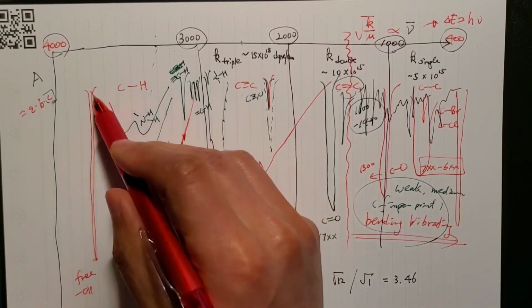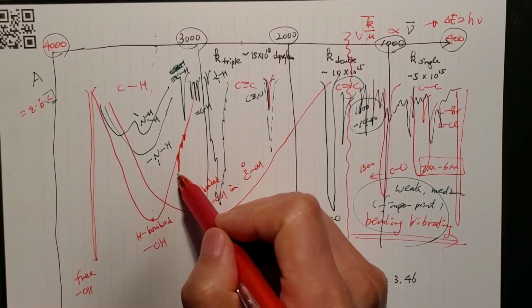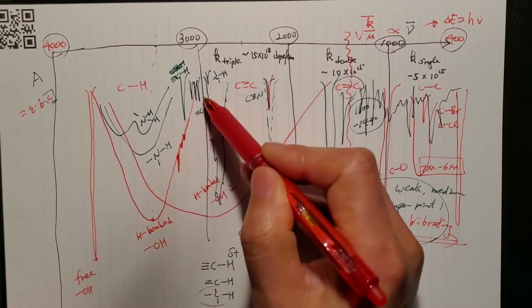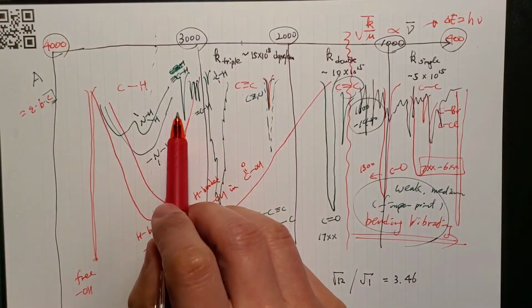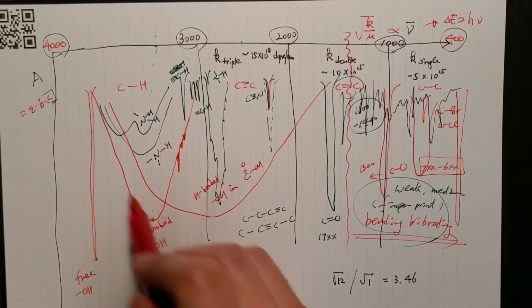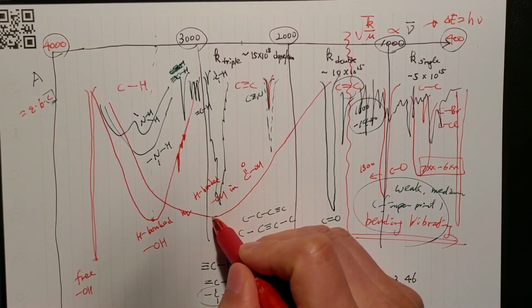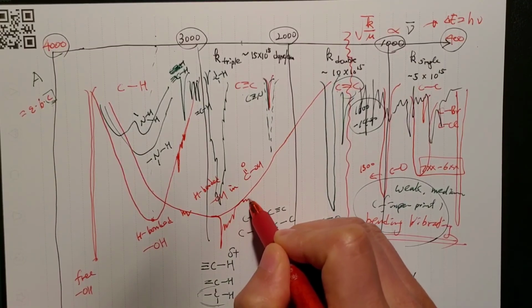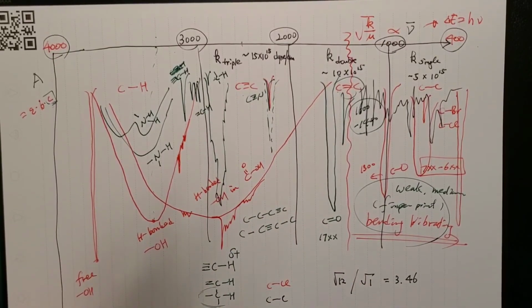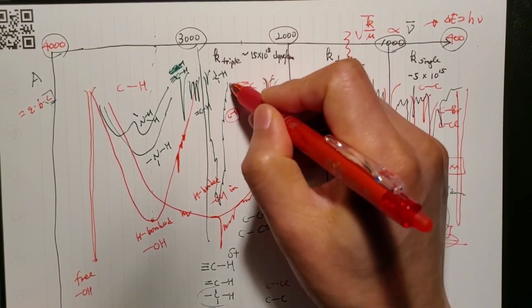So what's coming here in this number? You are finding just OH if you don't know that. But if you are aware of this fact, the little spikiness or shoulder is OH plus other things here, and they could be either CH on an sp carbon or sp2 carbon. For the broader carboxylic acid one, you expect a lot more spikiness, even like this, and then like this. Then there are also additional peaks, and there are also other CHs coming around here.